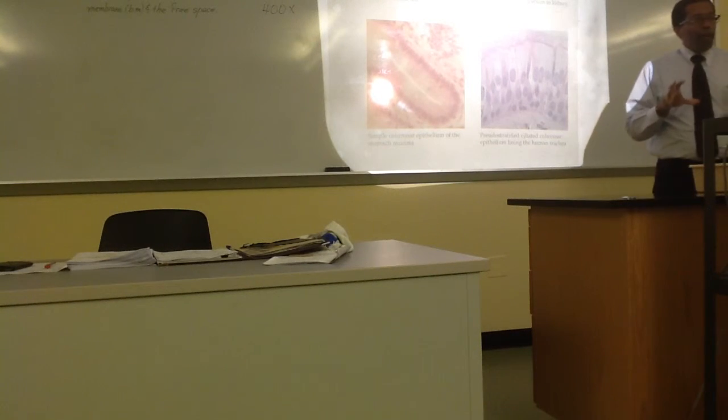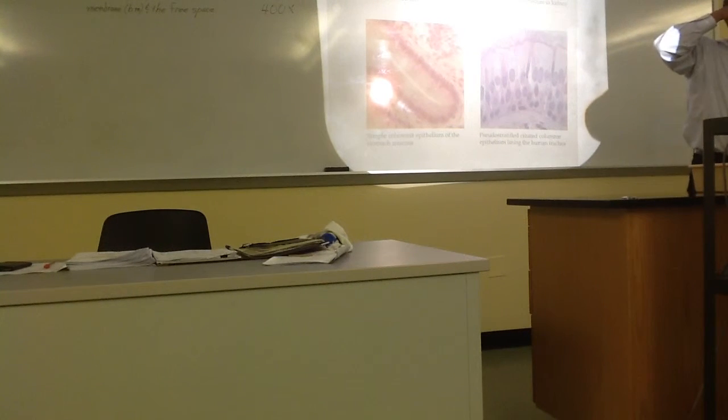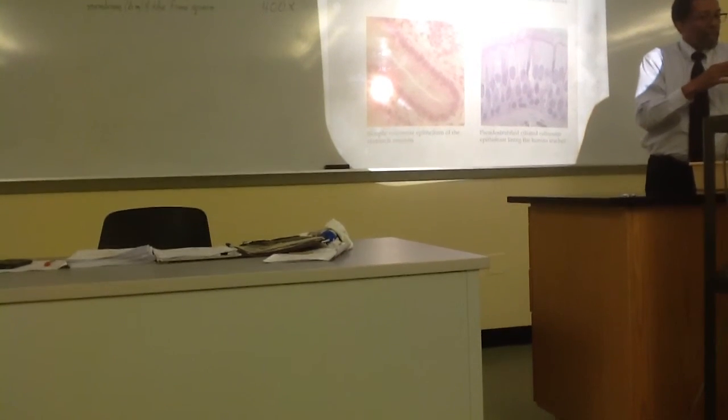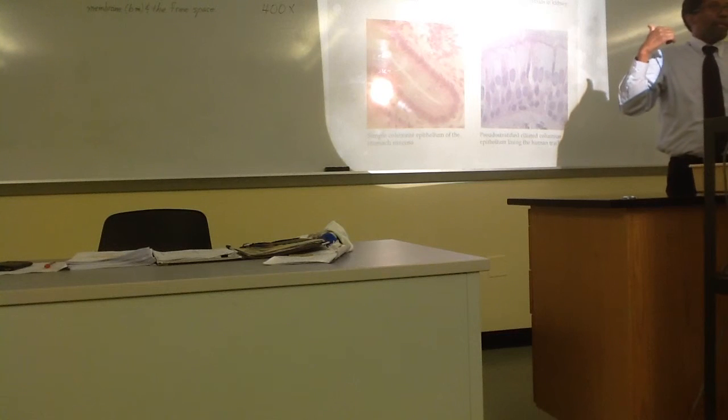Compound microscope means that the final image is based upon the magnification of the ocular lenses times the magnification of the objective lenses, okay? And so if our objective lens magnifies 40 times normal size itself, then when we're viewing the specimen using that 40x lens, the final magnification will be 40 times 10, or 400x.